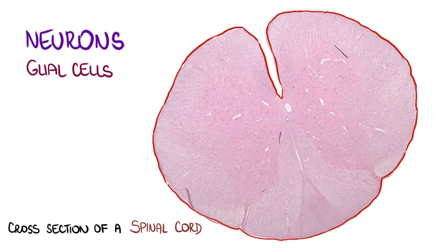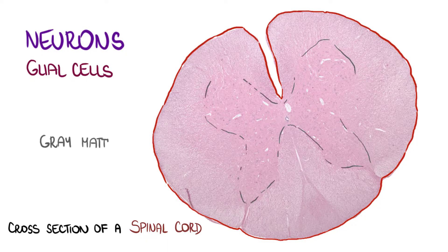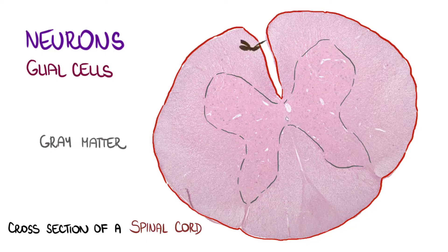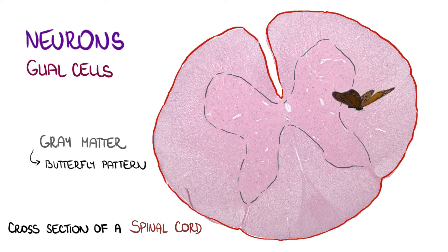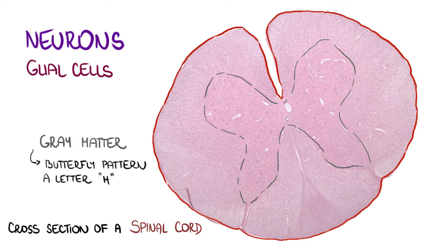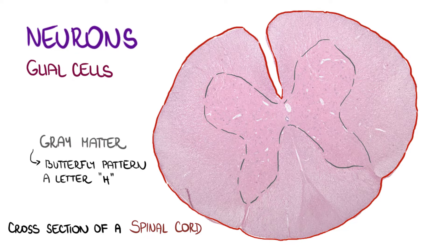We can recognize gray matter in the center and white matter in the periphery. Gray matter in the center has a typical butterfly pattern — it really looks like butterfly wings or a letter H — but what's more important is that we can find big neurons there.